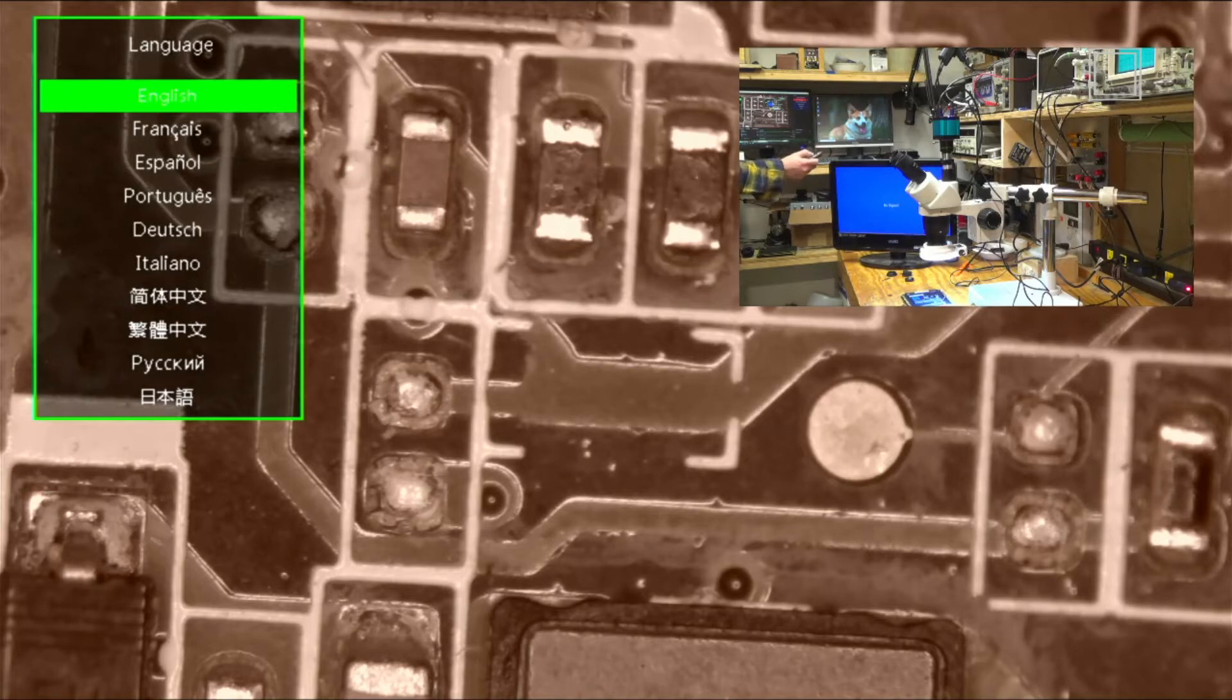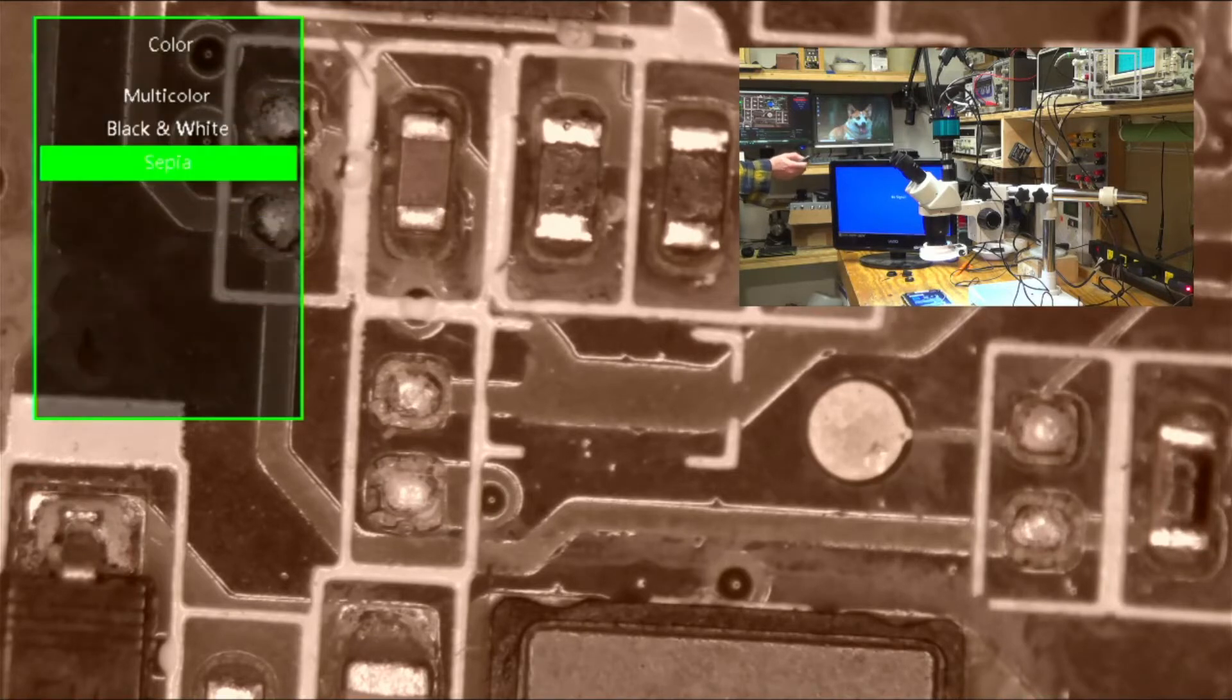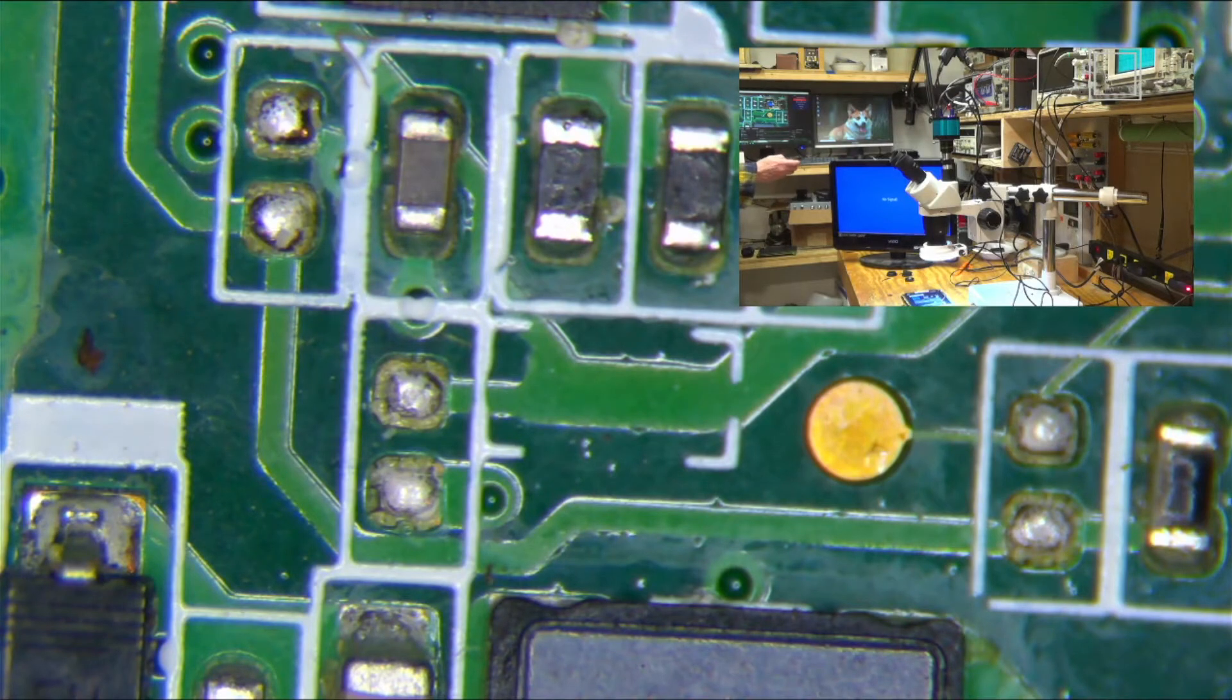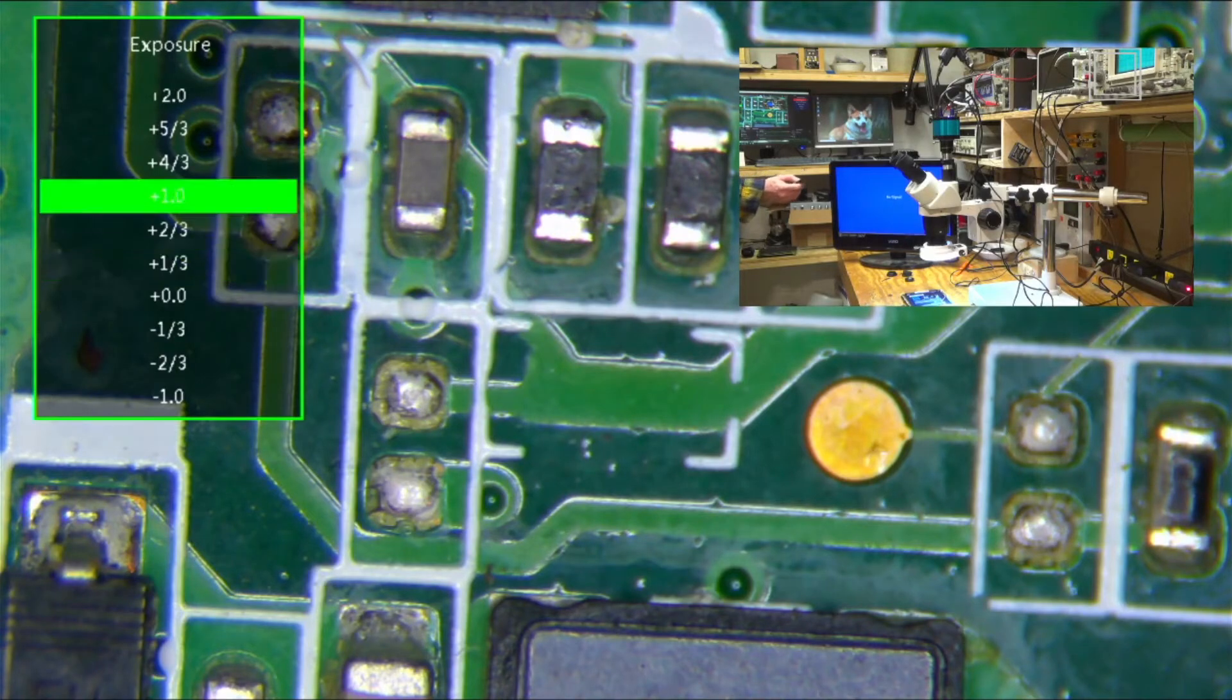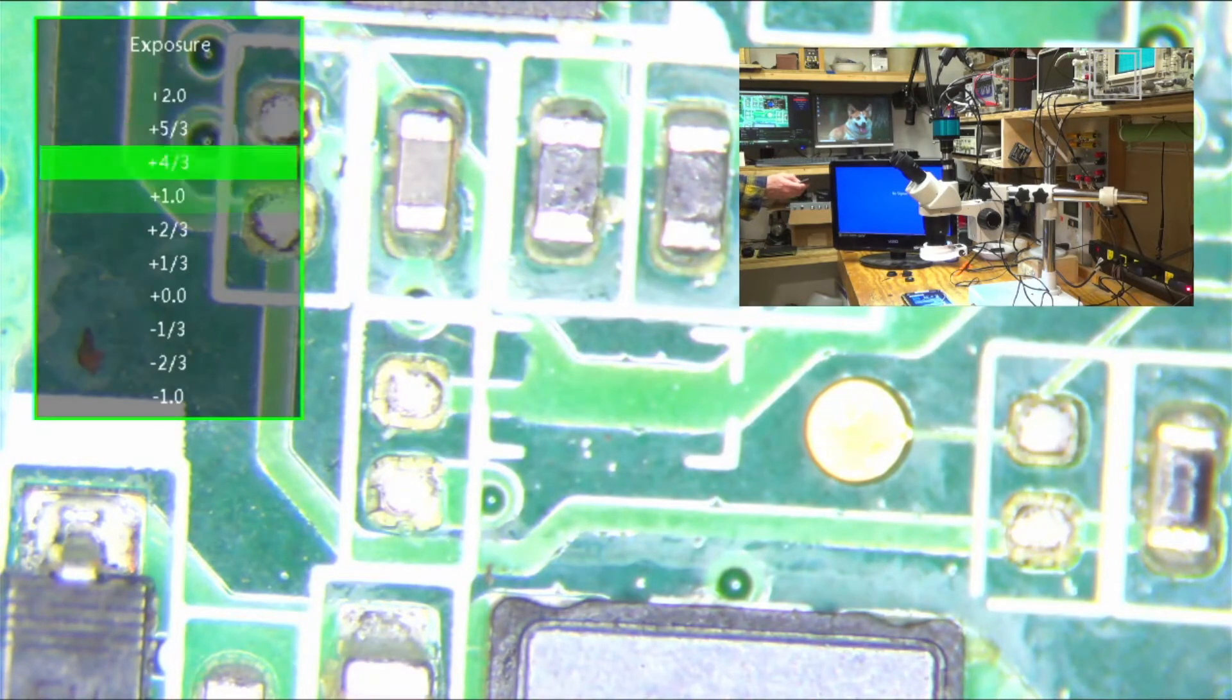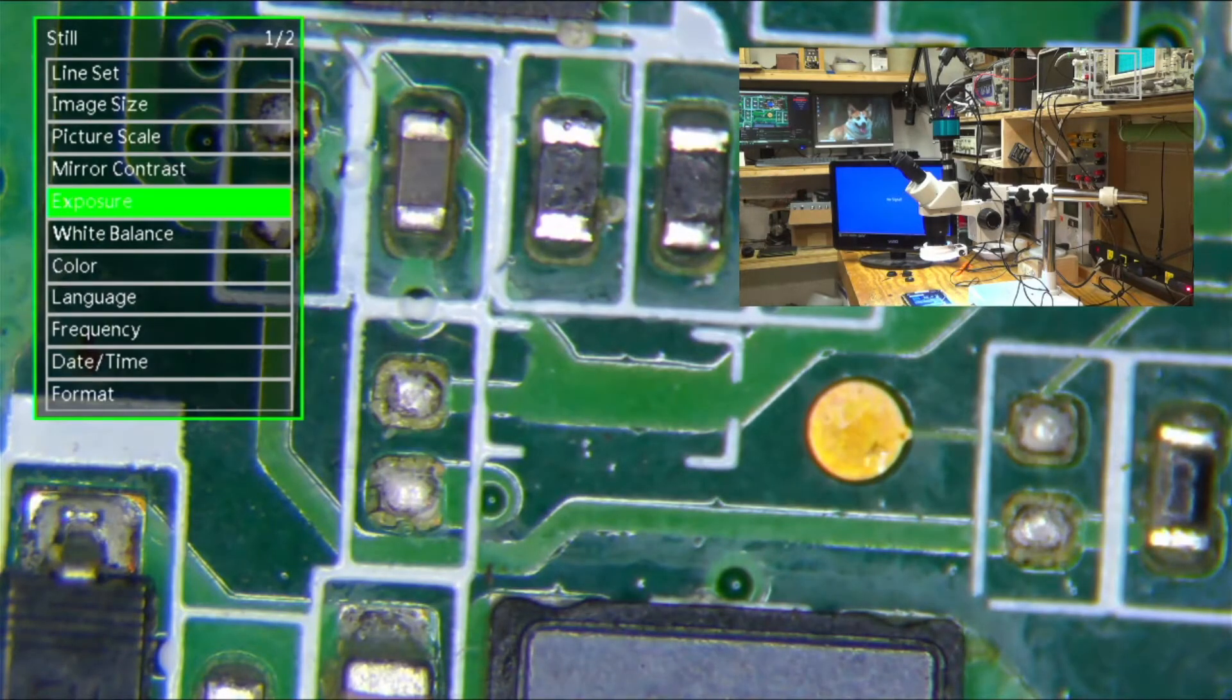Sepia, in case you want that old western look when you're working on your circuits. Whoops! And I go back to color. So you could switch—there's just a bunch of stuff to play with.